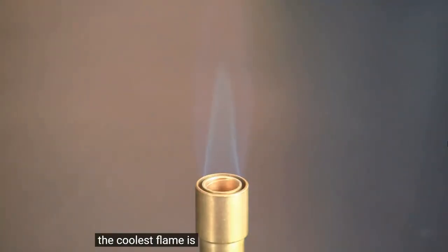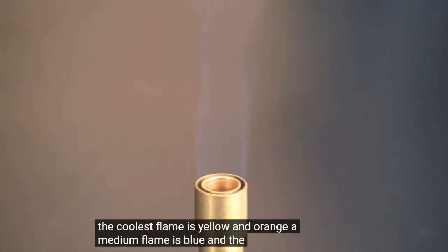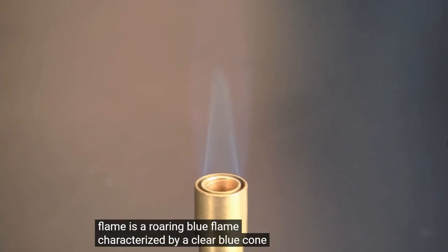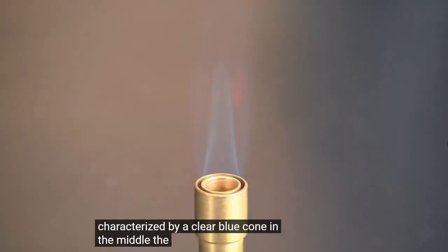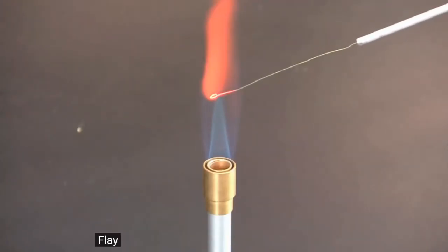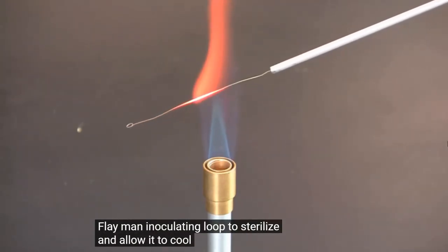The coolest flame is yellow and orange. A medium flame is blue, and the hottest flame is a roaring blue flame characterized by a clear blue cone in the middle. The tip of the cone is the hottest part of the flame. Flame an inoculating loop to sterilize and allow it to cool.